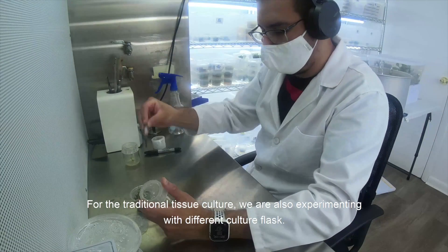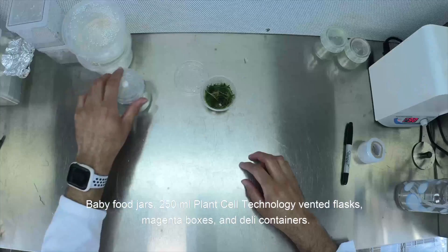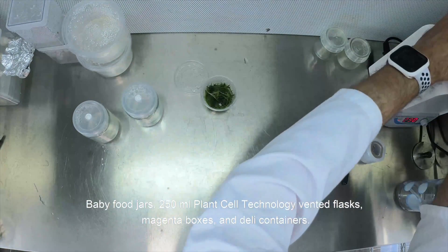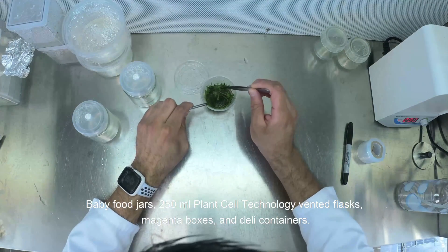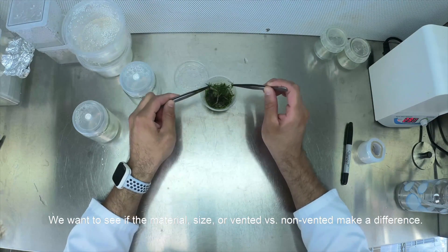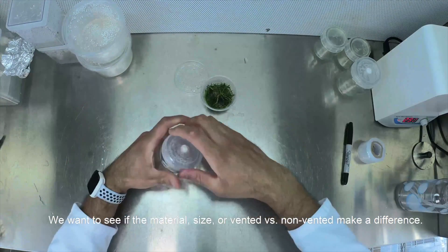For the traditional tissue culture, we are also experimenting with different culture flasks: baby food jars, 250 ml Plant Cell Technology vented flasks, magenta boxes, and deli containers. We want to see if the material, size, or vented versus not vented make a difference.